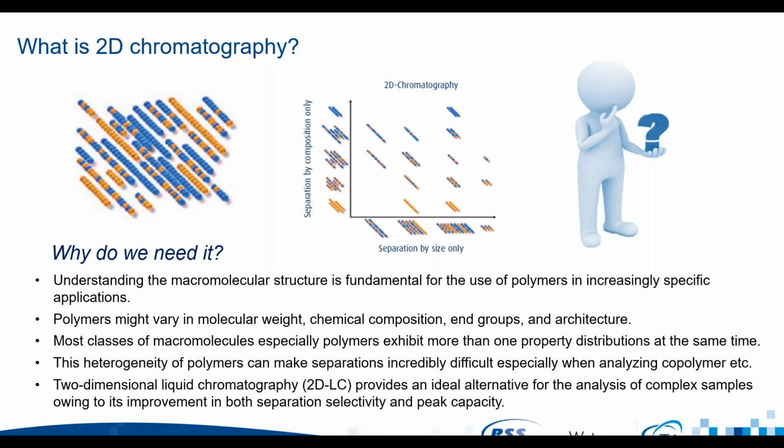So you can see there you've got some block copolymers, you've got some mixed polymers, you've got some polymers of a single composition, and they're all mixed in together, either in a blend or just by pure accident, which I can vouch for the fact happens regularly.